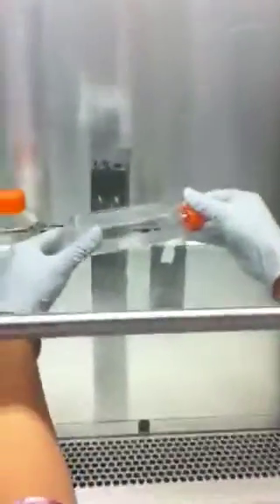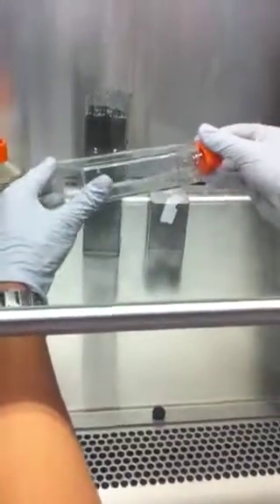So let's go into the hood. Once you add it, you need to make sure it gets everywhere, right? So you just slowly let it flow around to cover every single place. Okay. And then you aspirate out the wash. And now you do this again.